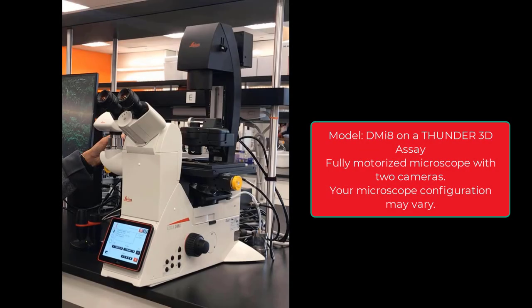Today, we'll look at a DMI-8 microscope that's part of a Thunder 3D assay system. It is a fully motorized microscope with two cameras. Your microscope configuration may vary.